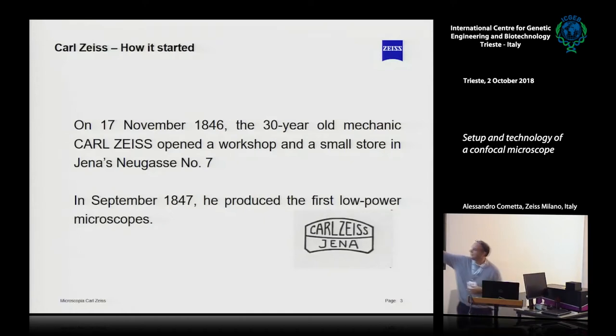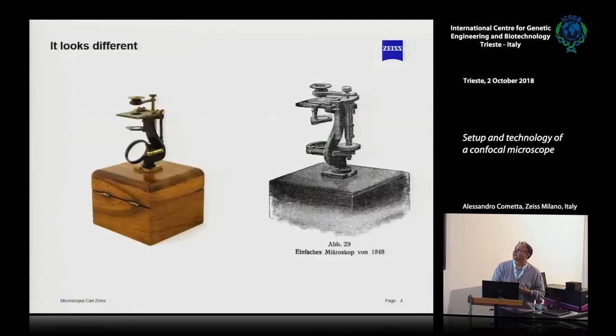This was the symbol, the brand, and as you can see, it is two lenses. And the same meaning is still in the actual brand. The first microscope was very, very different from the microscope you are used to working with today. This is the first microscope, and interesting is that the microscope is that part. Everything else is just a stand.